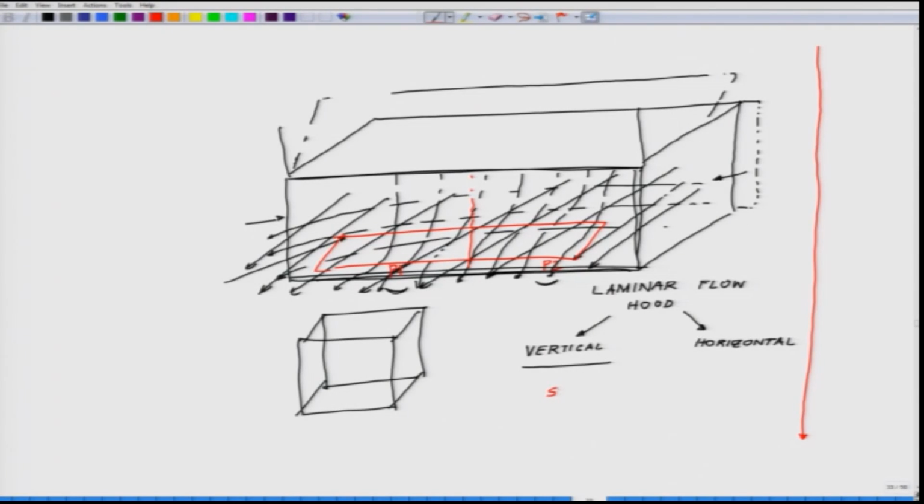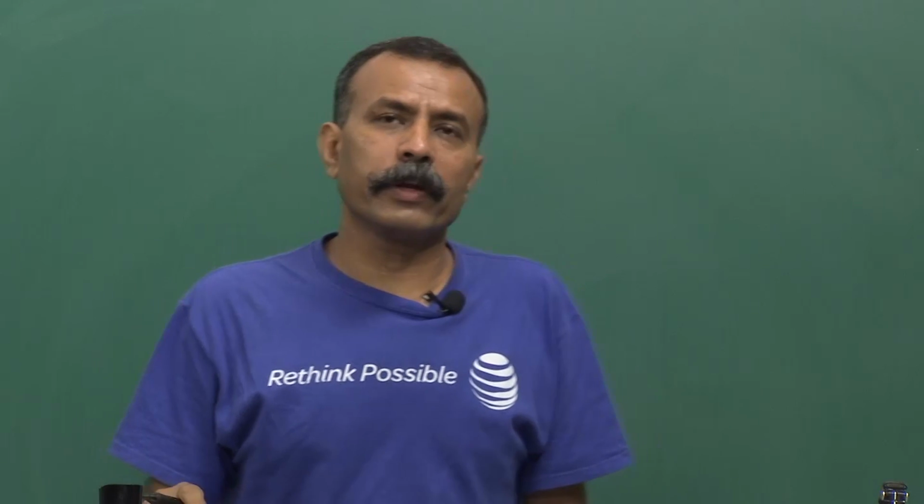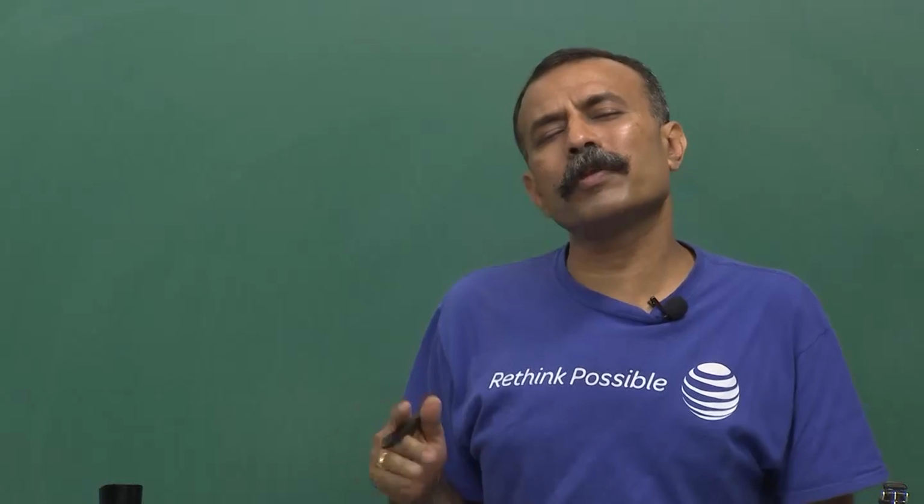The size, or dimension, you are looking for. One may sound like a trivial point, but it is directly related to your door height. However trivial it may sound, you have to get this laminar flow hood inside the room, so you have to ensure that they can do it. Do not just rely on the manufacturer taking care of it. Of course, the manufacturer will take care of it, but there are repairing issues, it may have to be taken out and so on. There are so many problems which come through it.